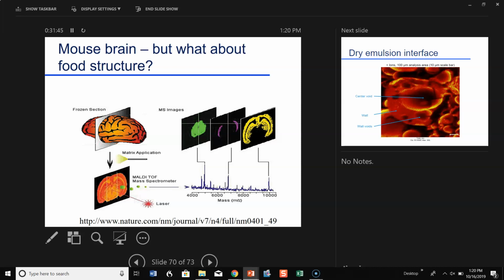But there's just simple other examples. I showed this tomato leaf put in front of the mass spectrometer, where it bounces off and measures what's on the surface. So that we look for pesticides, look for herbicides. We can look for any kind of residue on that fruit or on that apple.